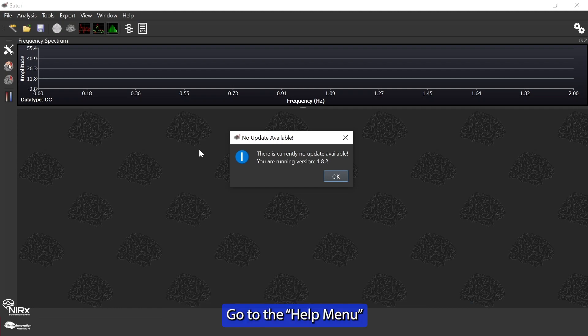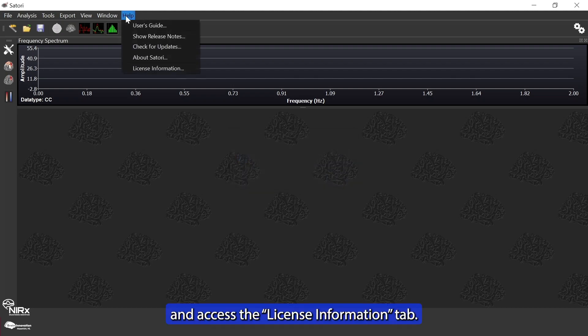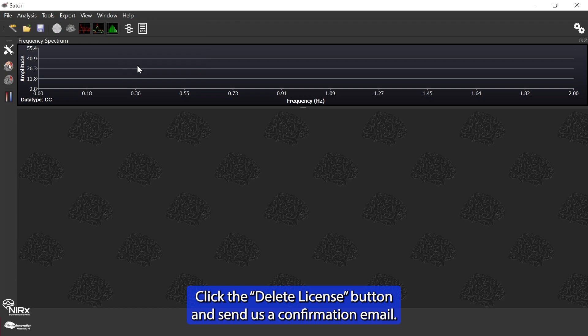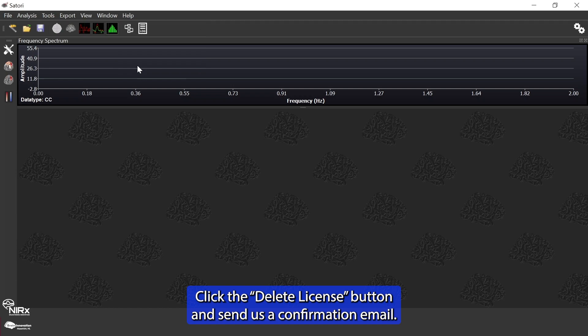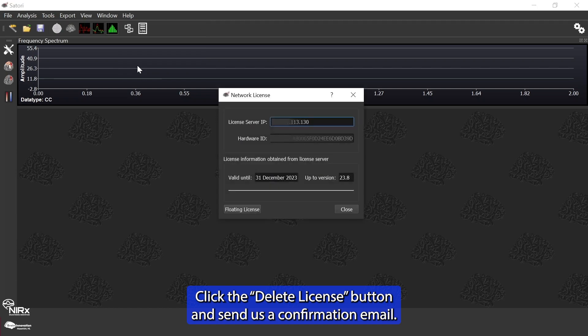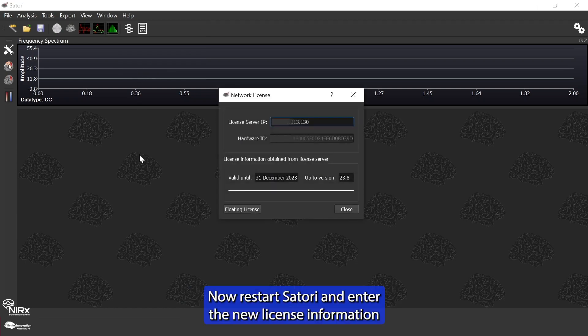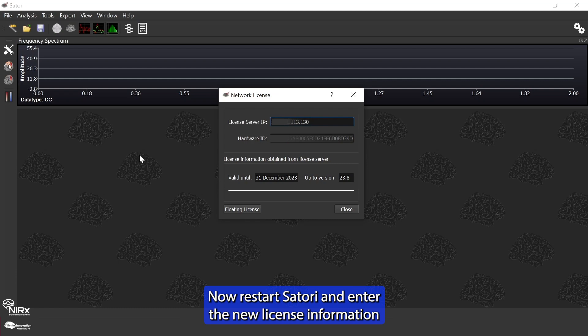Go to the help menu and access the license information tab. Click the delete license button and send us a confirmation email. Now restart Satori and enter the new license information you should have received.